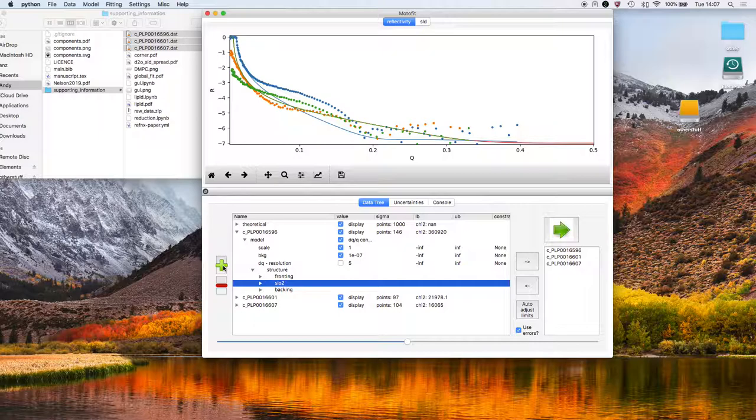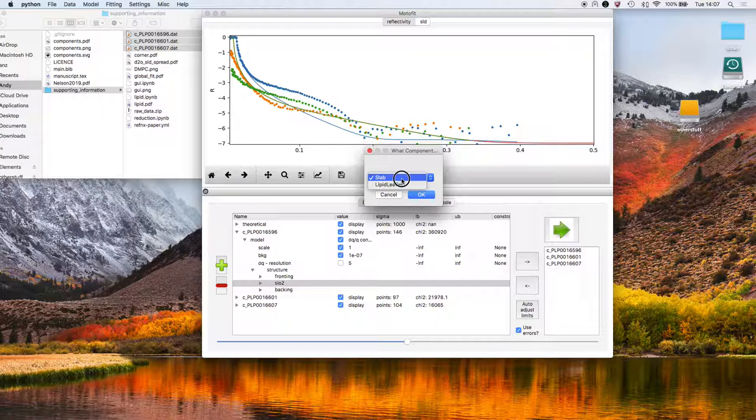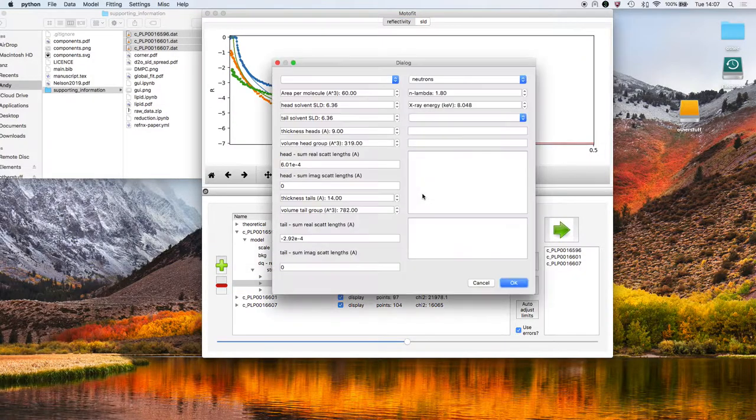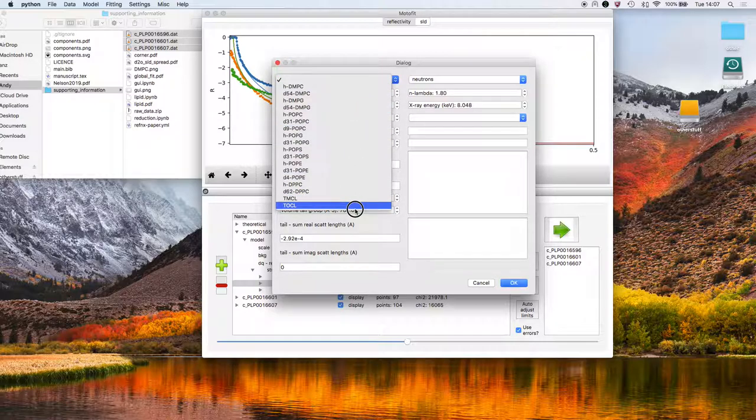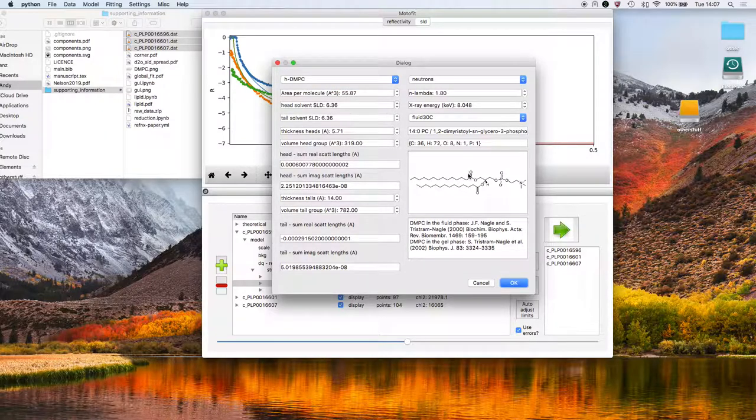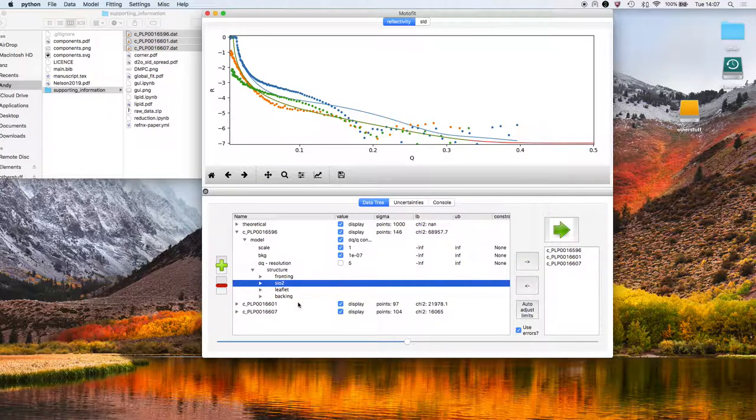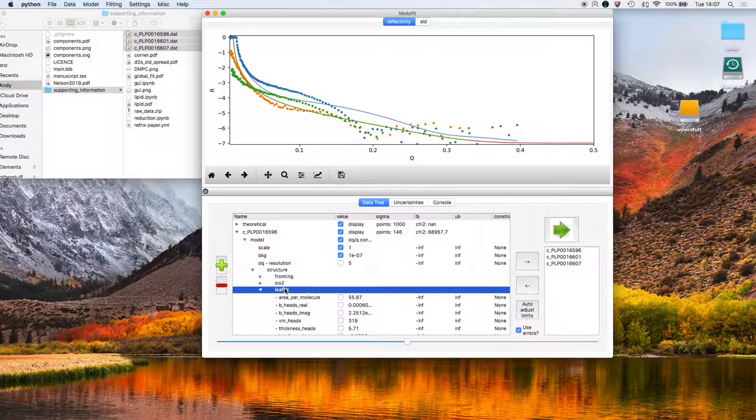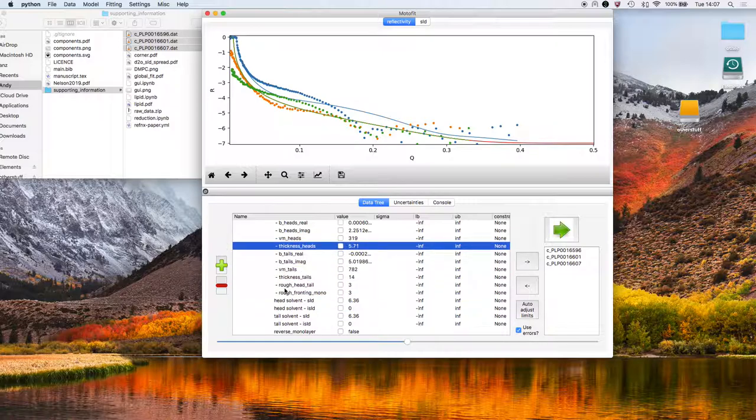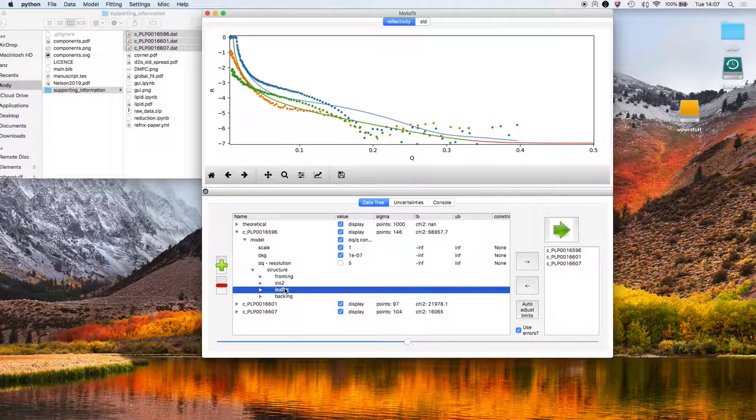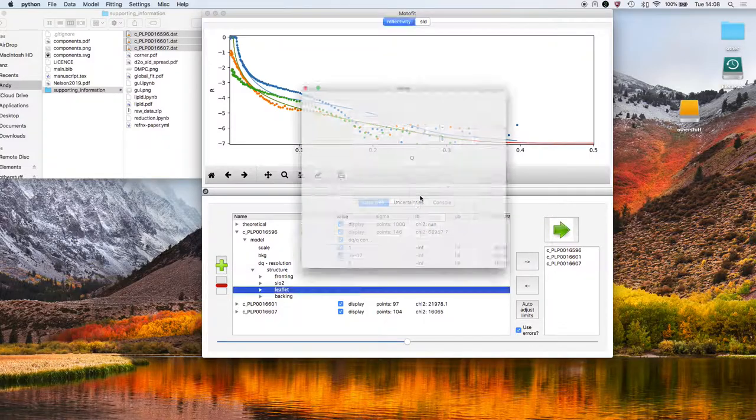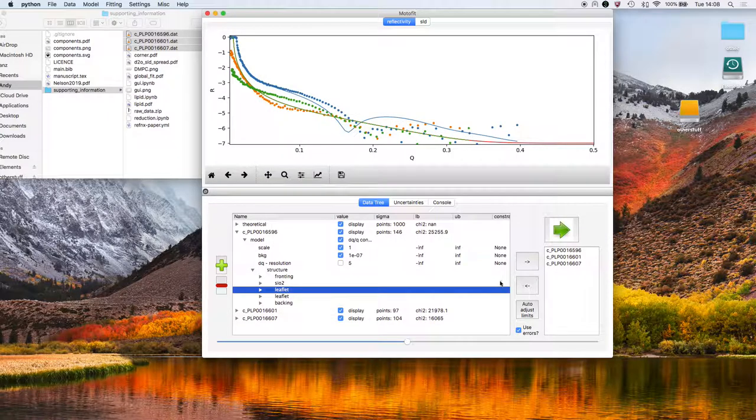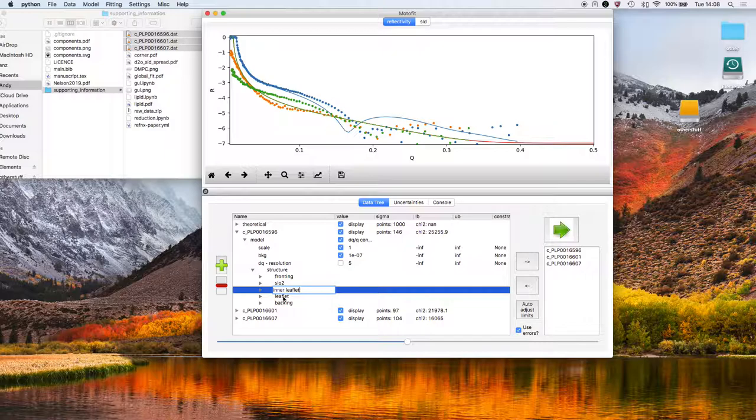So we can either use this plus button here. And we're not going to add a slab, that's a normal slab layer model. We're going to add a lipid leaflet. And we have the choice of a range of default lipids. I'm going to choose DMPC. This is a DMPC bilayer. And it gives us the structure and the relative parameters for this lipid. You can see now that that component has been added with its specific parameters. I'm then going to add another leaflet because we have a bilayer, that leaflet would either be the inner leaflet or the outer leaflet. So I'm going to add another layer. This time I use command plus, which is the shortcut for adding a component. Add another lipid leaflet. And now we have the fronting medium, the silicon dioxide, the inner leaflet, and the outer leaflet.